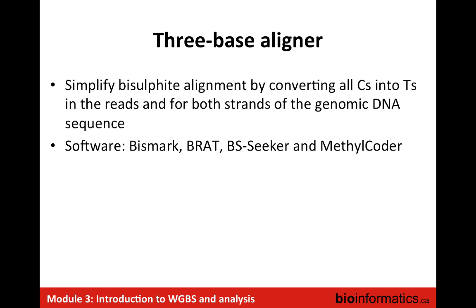So you convert all the C's into T's in the reads and in the genomic DNA, doing that on both strands. So this is a strategy where you really forget about the four-letter alphabet and implicitly convert everything into a three-base alphabet. And after that, we'll extract back for the mapping step what was really happening. So again, we'll show an example.